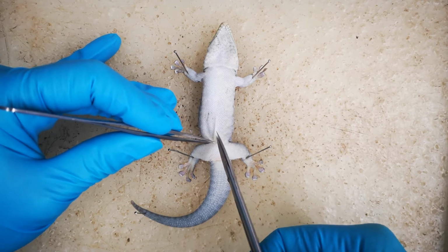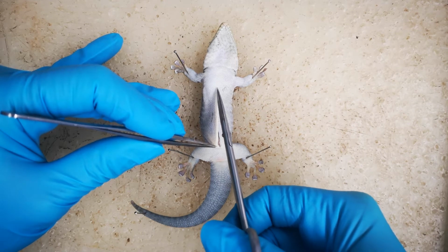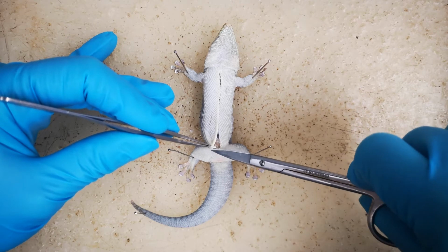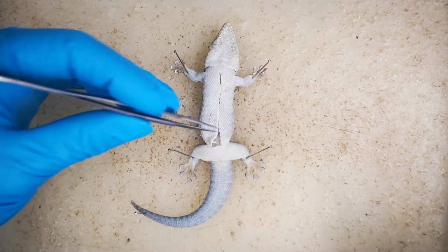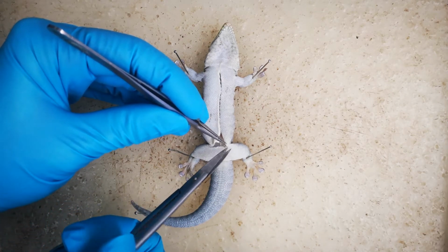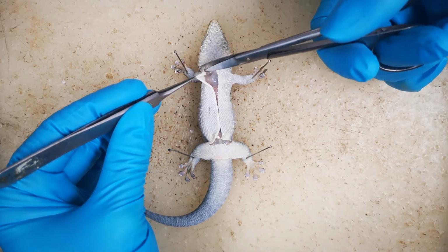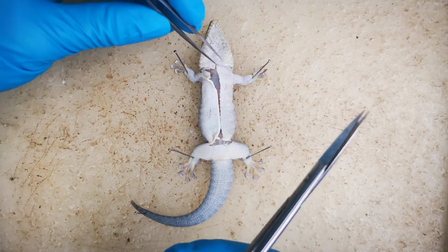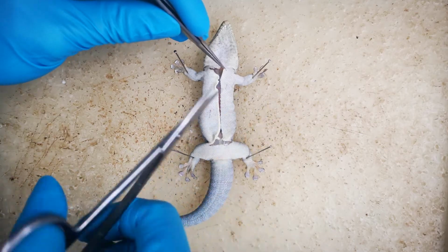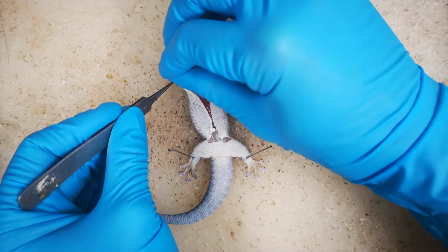We then make lateral incisions at either end of this sagittal line. The skin of the trunk is pinned to either side, taking care to separate the viscera from the skin by running a blunt probe along it as it is pulled away.